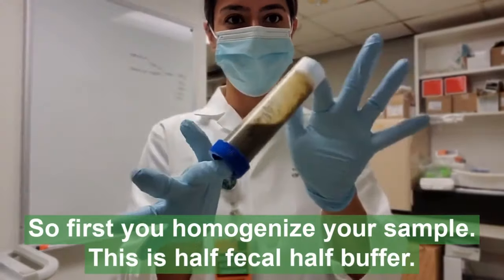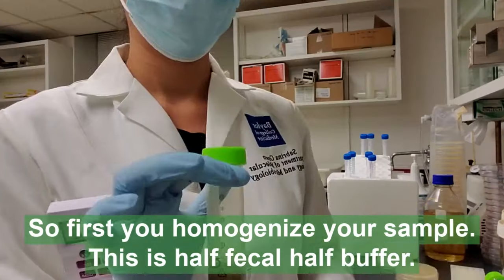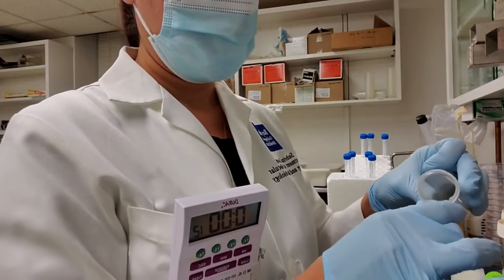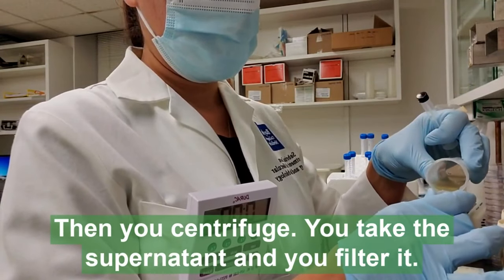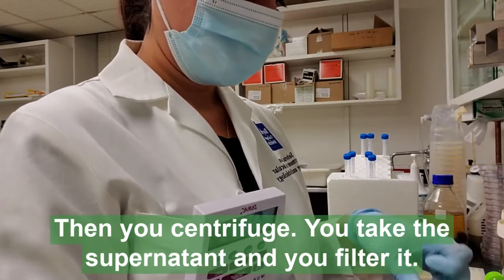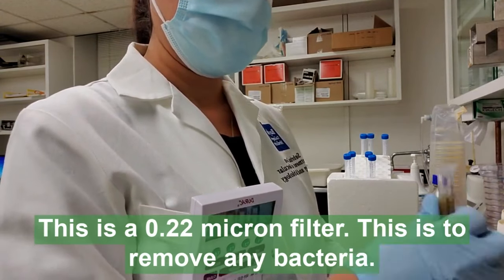First you homogenize your sample — this is about half fecal, half buffer. Then you centrifuge. You take the supernatant and you filter. This is a 0.22 micron filter, and this is to remove any bacteria.